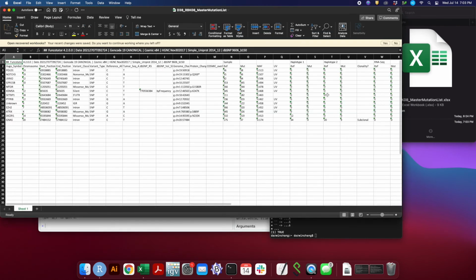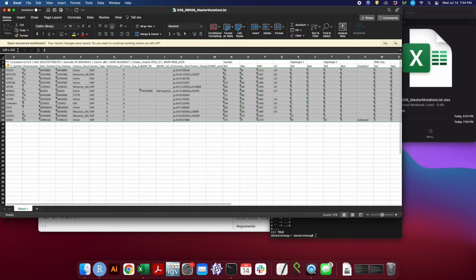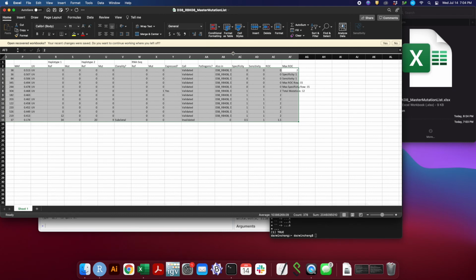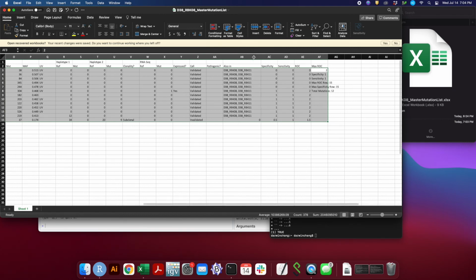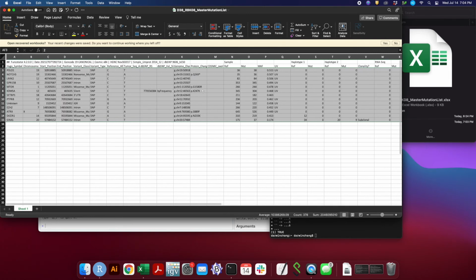To finalize, just convert everything to numbers. Make sure again at the very end there's no clonally related, or not clonally related, manually inspects. And yeah, this is it.